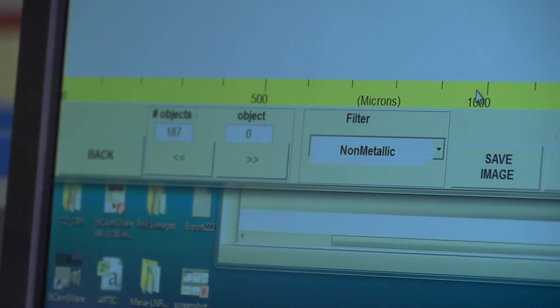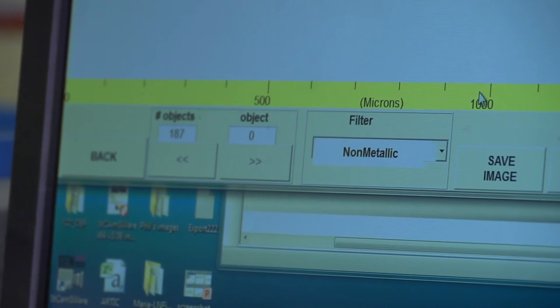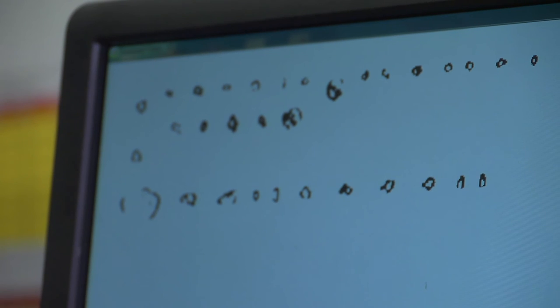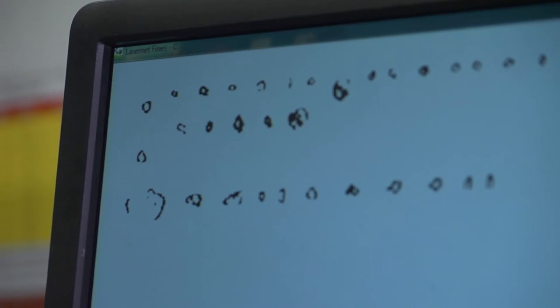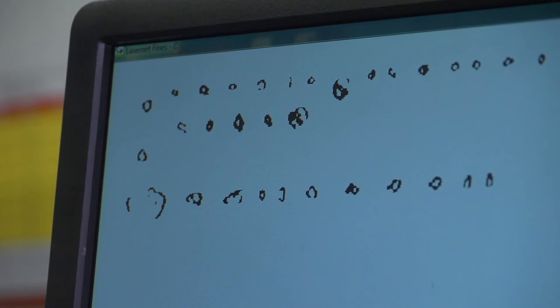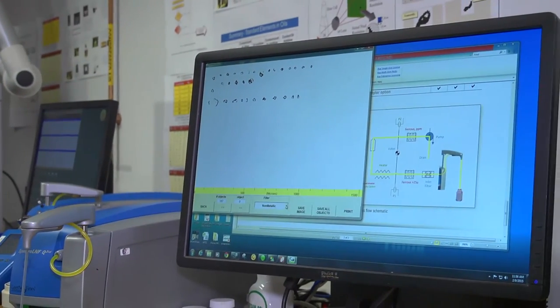Non-metallics, which have a typical void in the middle, because silicon dioxide, sand, is actually a crystalline structure, and it's translucent. So some of the light gets through, some of it doesn't. And that way we can discern whether it's a non-metallic.